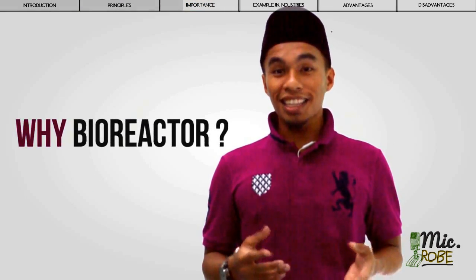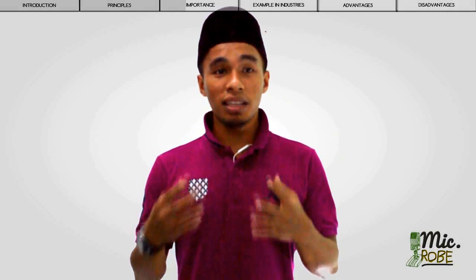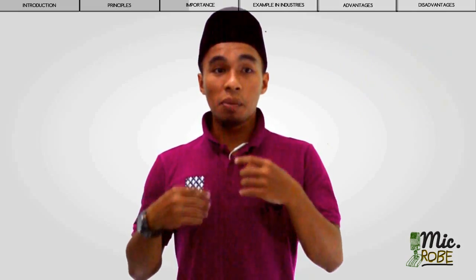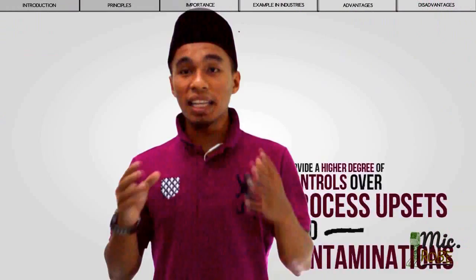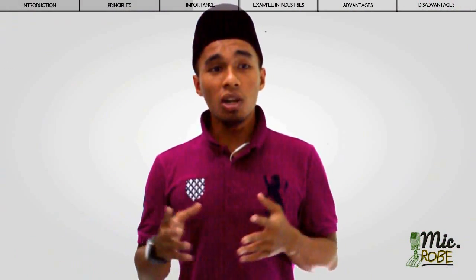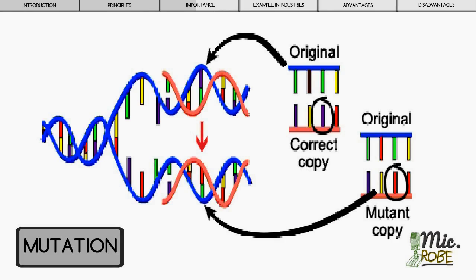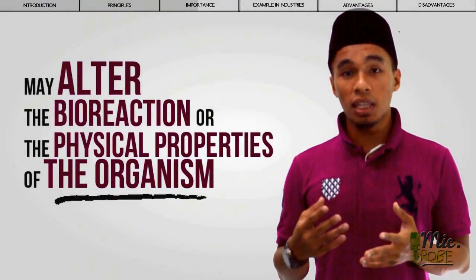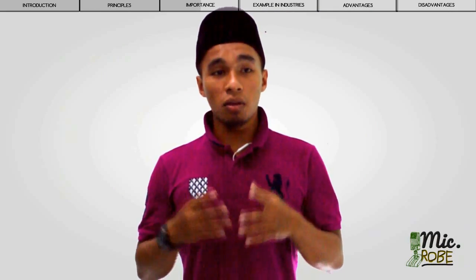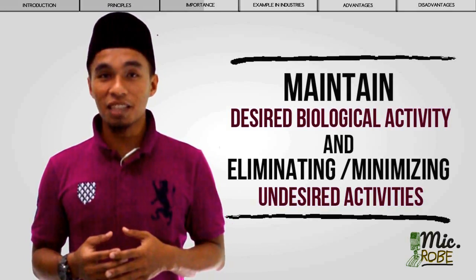Why is bioreactor better than traditional chemical reactor? Actually, bioreactor is different from traditional chemical reactor because it supports and controls biological entities. Bioreactor systems are designed to provide a higher degree of control over process upsets and also contamination. Since organisms are less stable than chemicals, if we do not control well, they will mutate, which may alter the bioreaction and also the physical properties of the organism. So here we can see that bioreactor will maintain the desired biological activity and eliminate undesired activity.